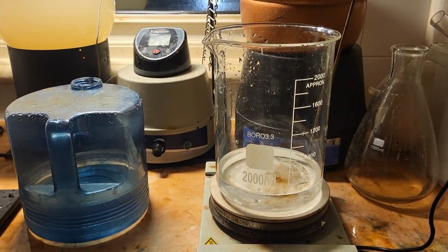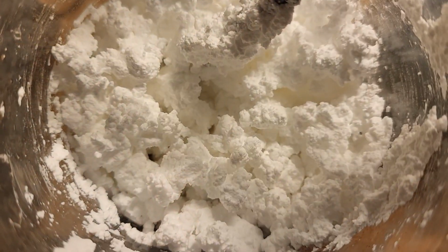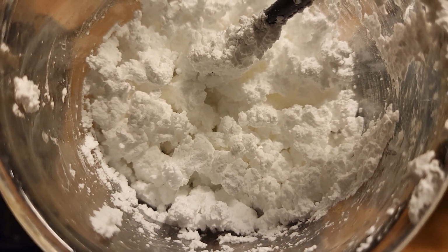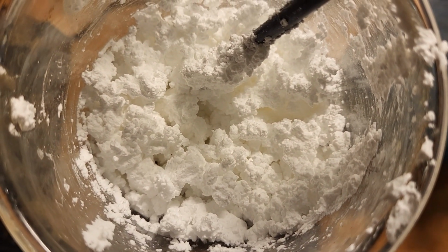We are going to dissolve our benzoic acid in boiling water. It looks nice, but it is not as pure as we would like it. So we're going to recrystallize.